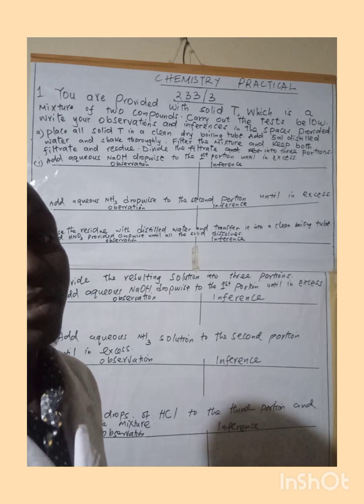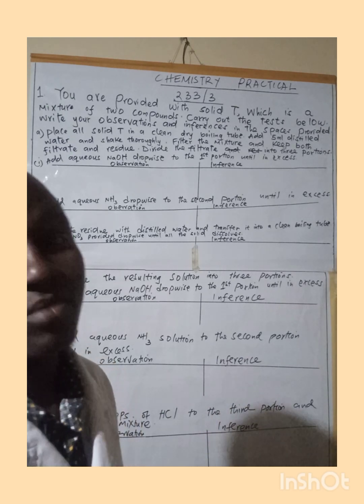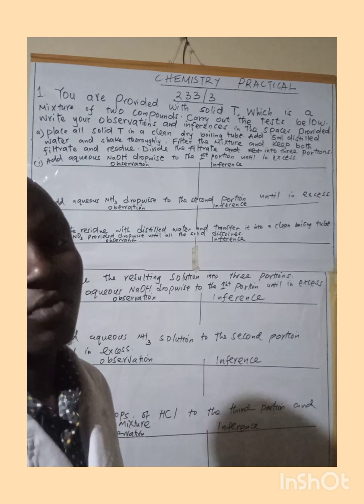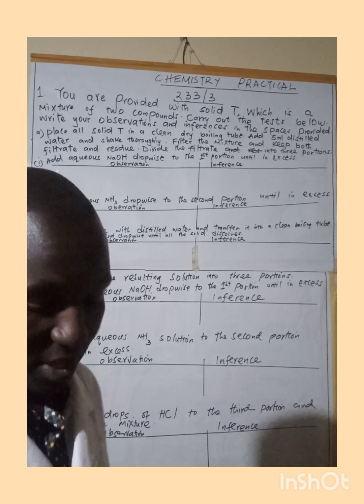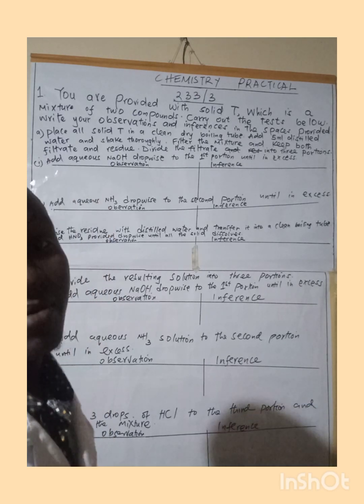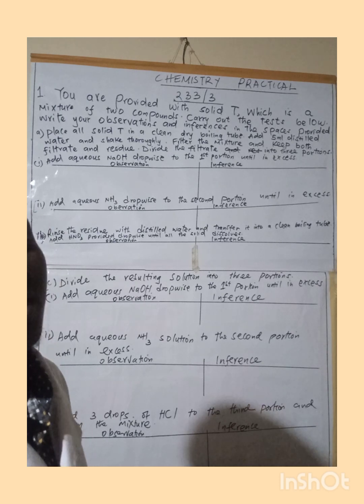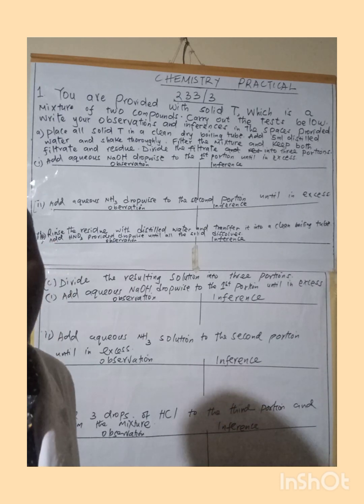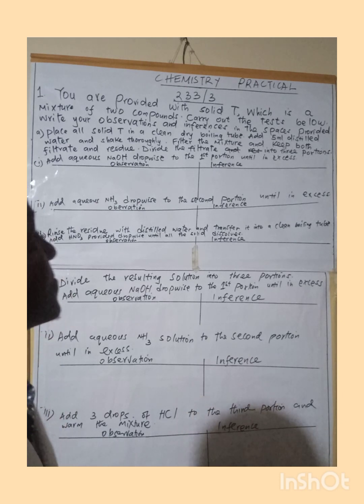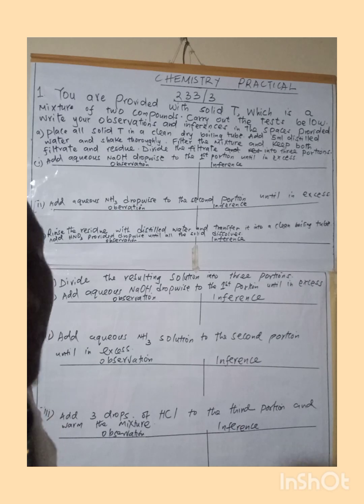So today we are discussing inorganic chemistry, that is qualitative analysis, chemistry 233/3. And I have a question on qualitative analysis for identification of cations and anions as it is shown in the chart. Now, we have a procedure which is given, and I will read.